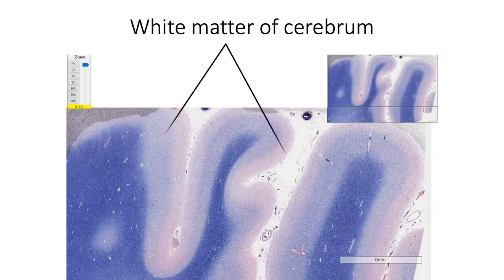The white matter of the cerebrum consists of both corticofugal and corticopetal fibers. The afferent fibers predominantly end in layers 1, 4 and 6 of the cortex, maximum number of fibers terminating in layer 4.